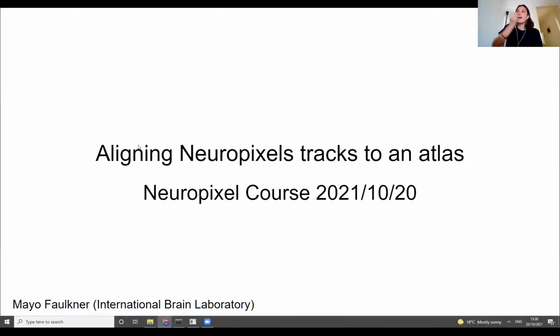Thank you. So today I'm going to talk about one of the final steps in the histology pipeline. This is to use electrophysiology features that you have recorded on the probe to help align the track in the atlas and get an accurate estimate of where your electrodes are in the brain, so where you've been recording from. I'll first give a short introduction to the topic and the concepts, and then I'll go on to show a demo of the tool that we developed within the International Brain Lab for this purpose.